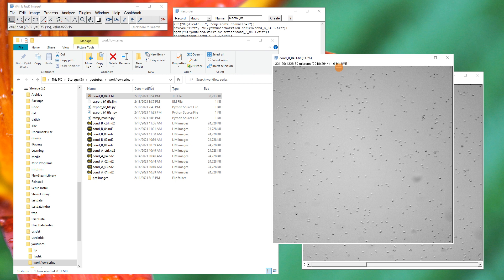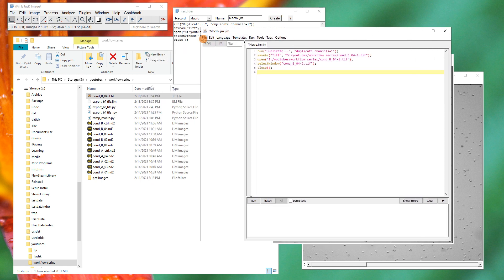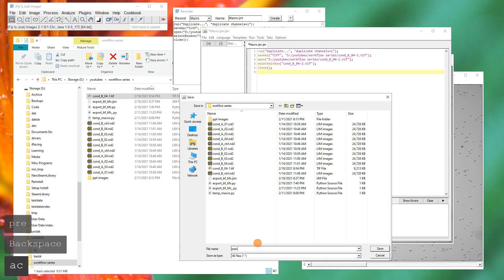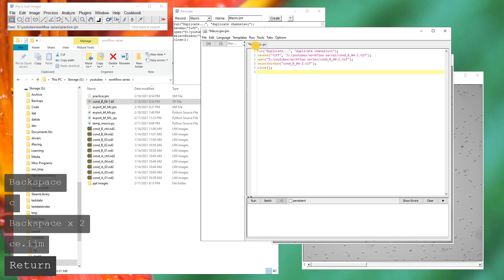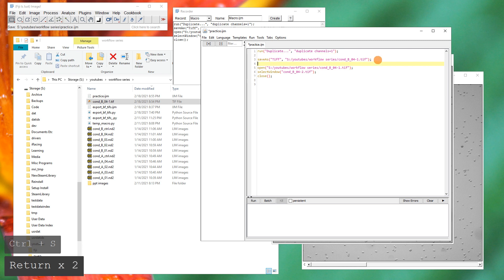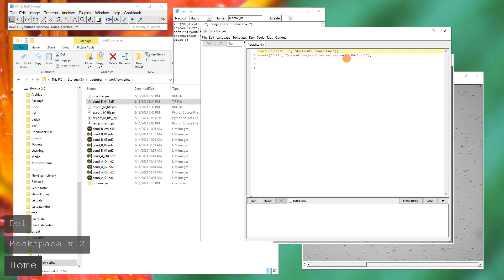The question is now how do we get that into a loop and do all of the files in this particular folder. We'll hit Create and it creates an ImageJ macro. We'll Save As — always good practice — and make sure we put the ImageJ macro extension on the end, otherwise it's going to save a blank file. The asterisk indicates it hasn't been saved yet; hit Ctrl+S to actually save. We've got the duplicate channel and save TIFF commands — those are the two key things we want. The rest is about figuring out how to make that into a loop.